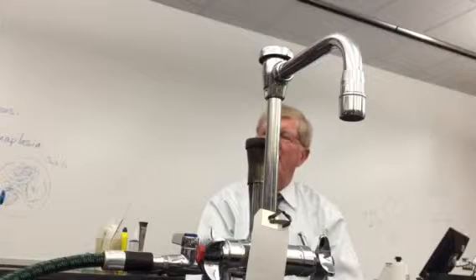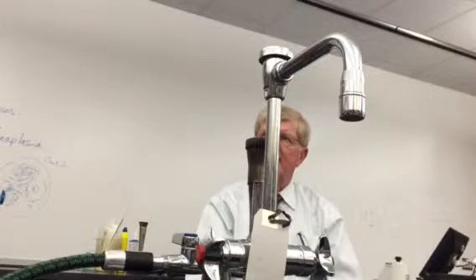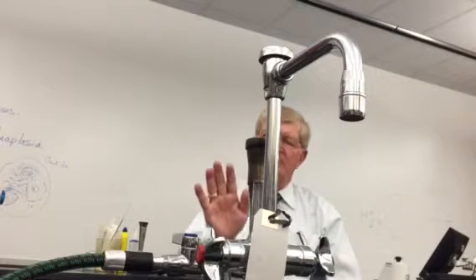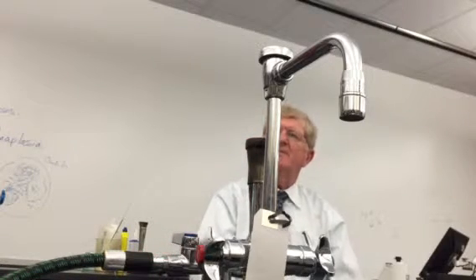You need to know how to calculate the number of bacteria in a unit volume of urine. You count the number of colonies times the number of milliliters, the reciprocal of the dilution. Now that you have that number, next question: what's the significance of that number?